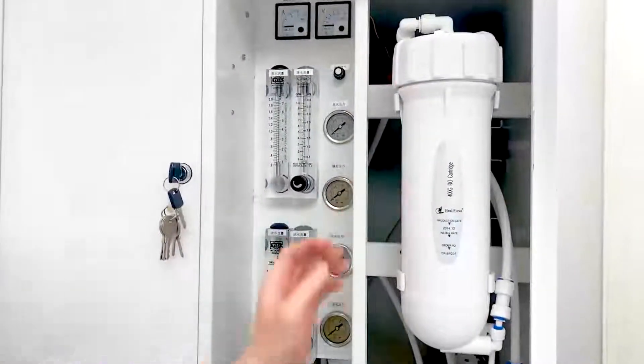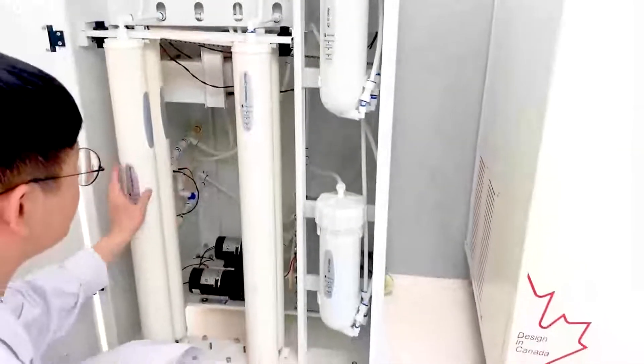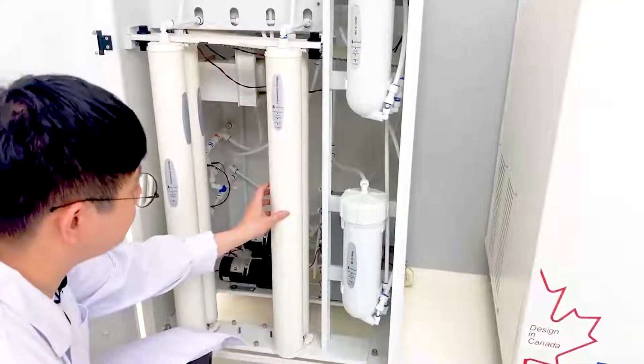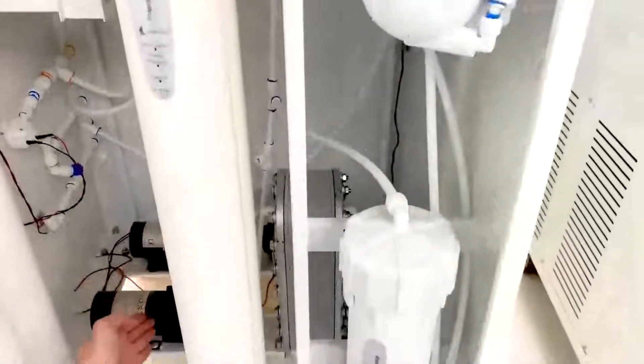Let's take a look inside. We have RO cartridges — three here and two pre-treatment cartridges here. We also have EDI and a pump.